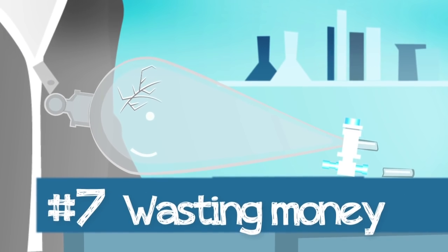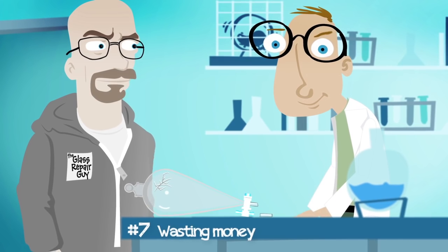Number 7. Wasting money replacing broken glassware? Use your savings on a new lab coat.